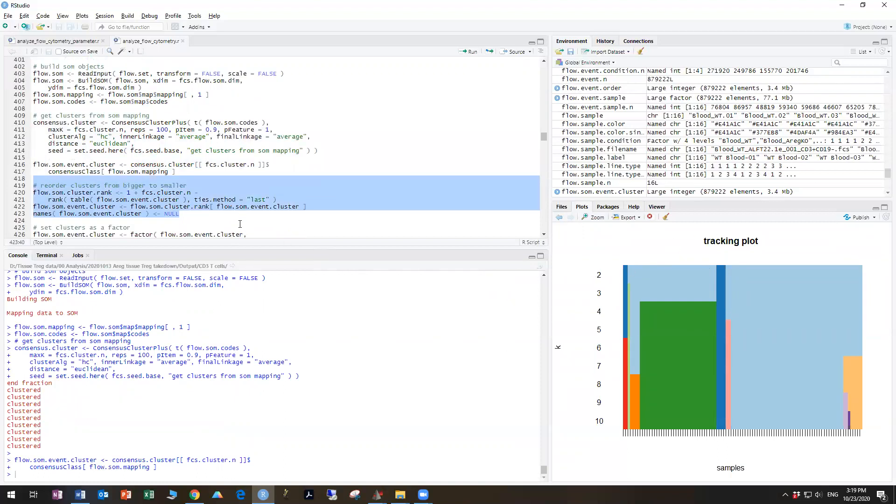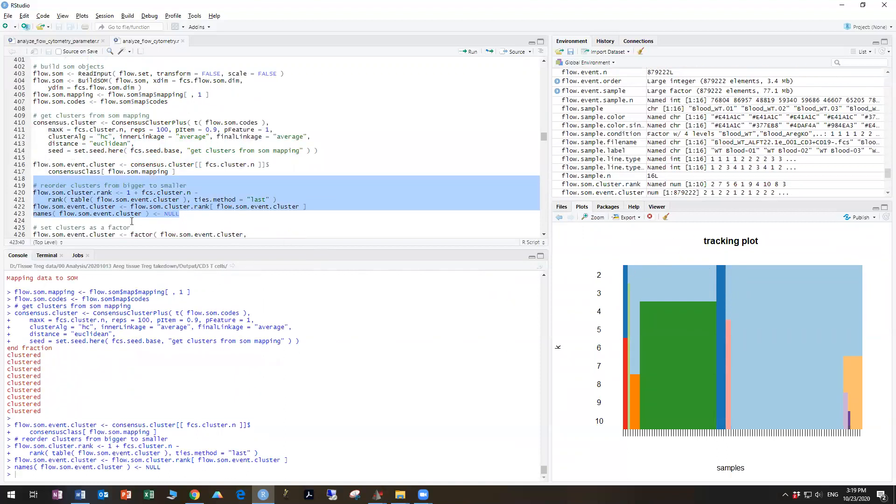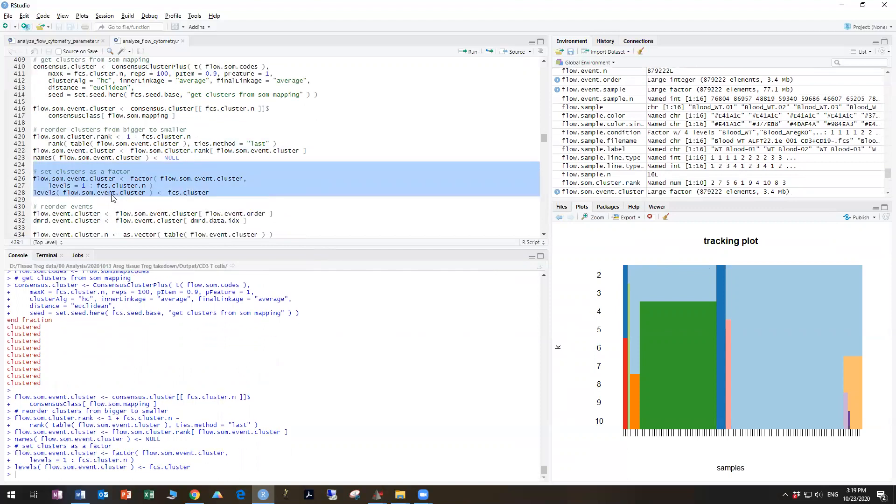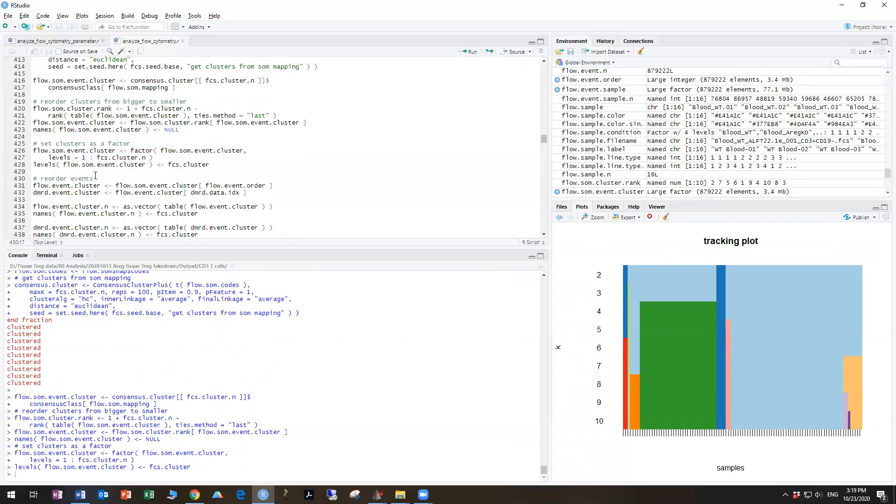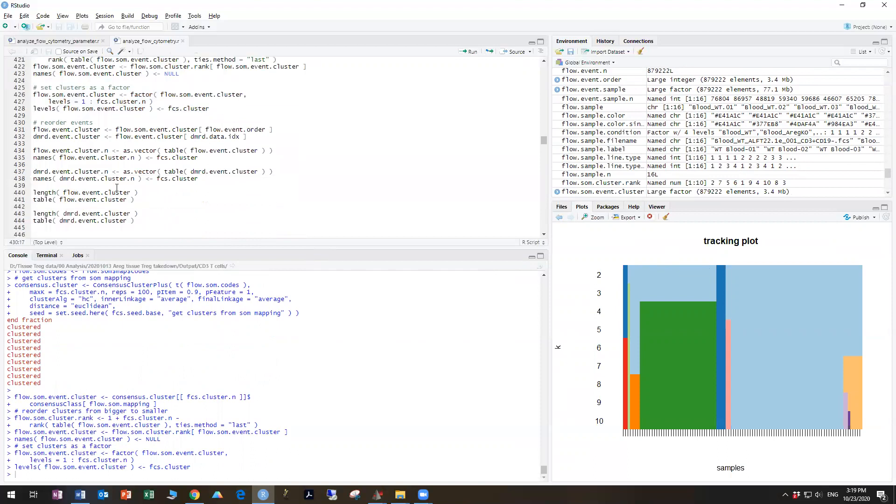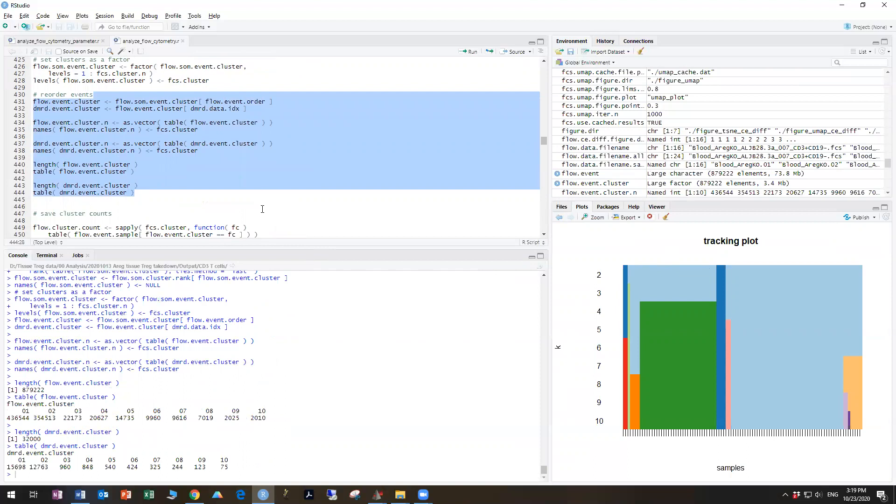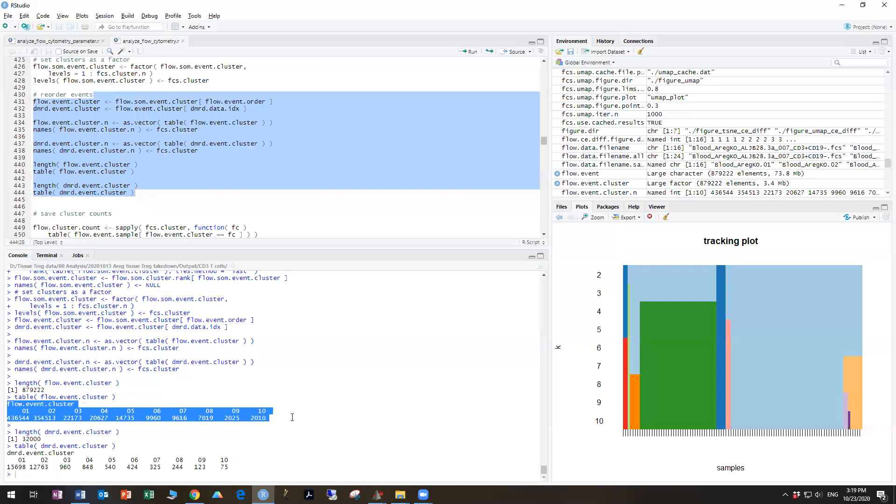All right, next section. These are all fast. And now these are the clusters.